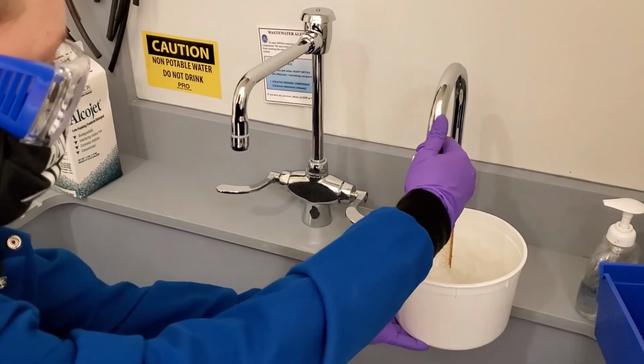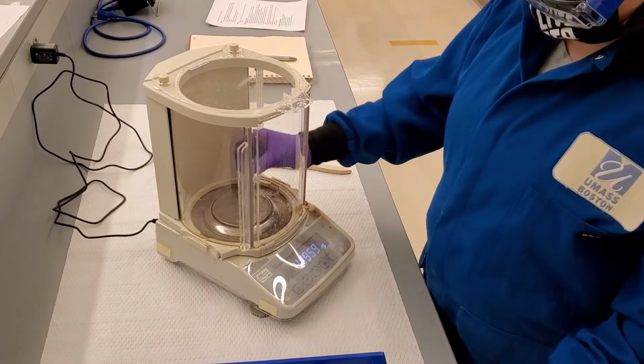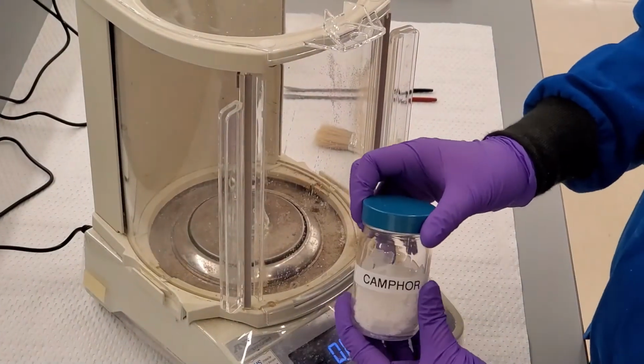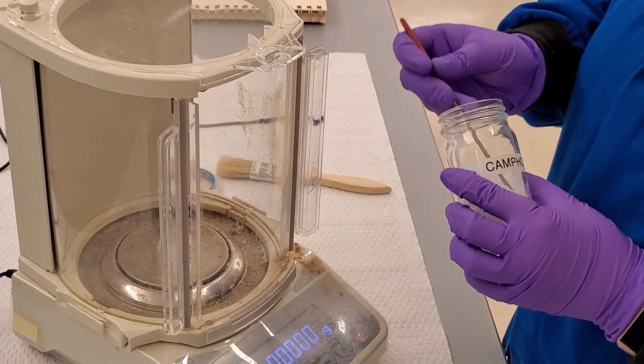While the water is cooling, we will weigh out our starting materials. First, clean off the balance with the brush, place the Erlenmeyer flask on the balance, close the doors, and tare the balance. Add about 0.10 grams of camphor to the Erlenmeyer flask. Record the final amount in your lab notebook.